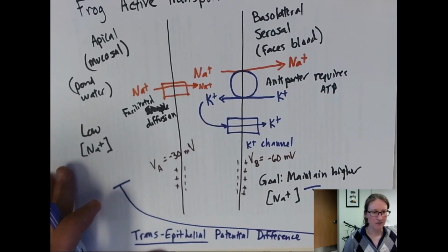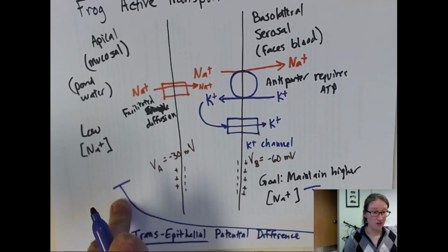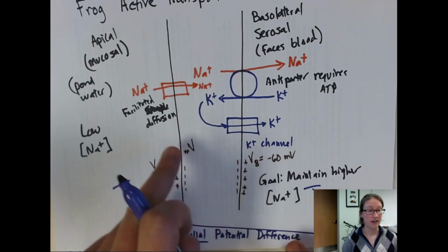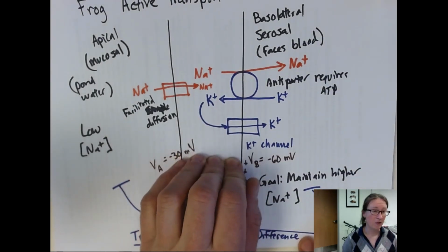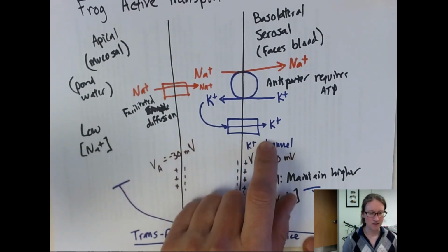So collectively, these transport processes are going to translate into a measurable electrical charge across this membrane, so long as these transporters are functional. So that's where the fun part comes in: part of what we're going to do is test this hypothesis about this arrangement of transporters across this tissue.